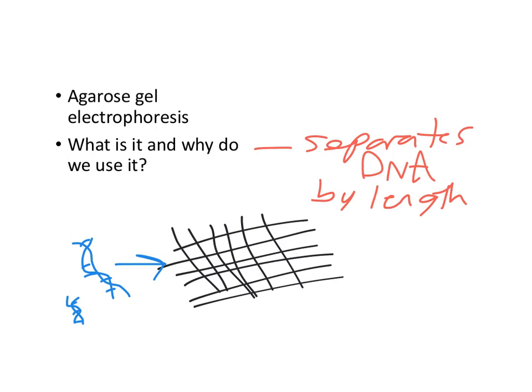Okay, so here's an important point. Combining these two thoughts. One is charge. What charge does DNA have? Negative. Phosphate backbone is negative. So there are negative charges on both of these molecules. So the electrophoresis part, phoresis means move, electro means we're going to zap it with electricity.